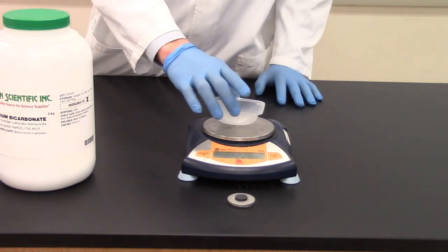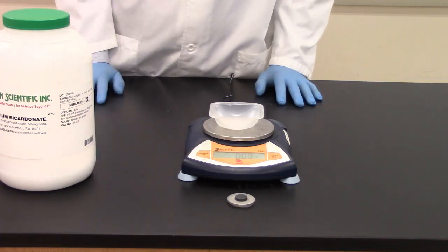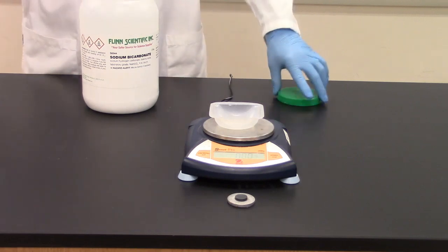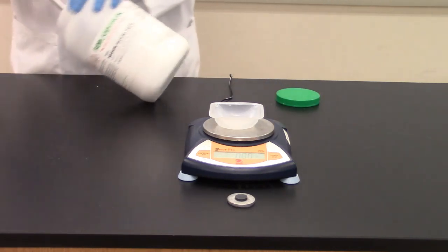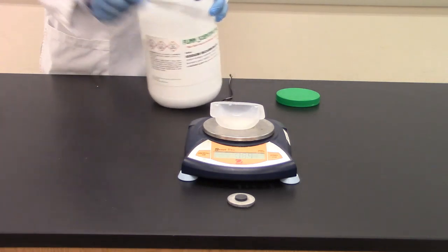So I'm going to go ahead and put my weigh boat on the balance here and I'm going to press the zero button. And then I'm going to scoop out an amount of sodium bicarbonate and again the mass is for you to determine. I've got my mass on there.